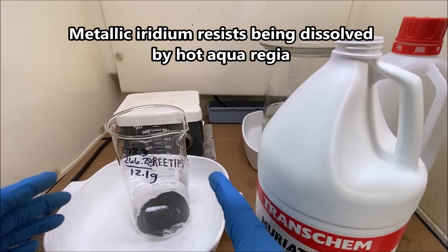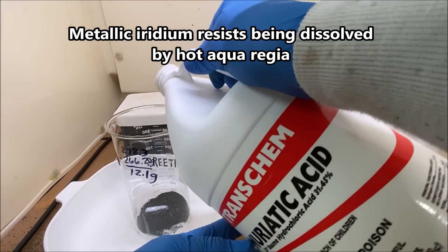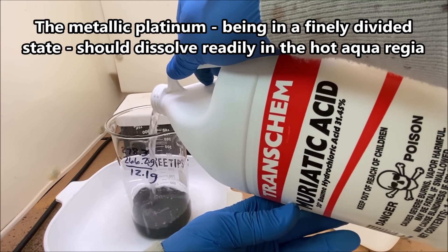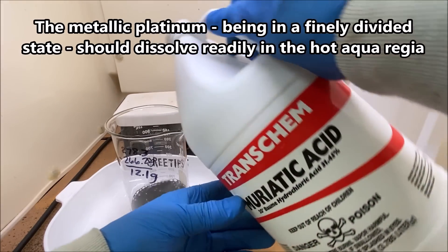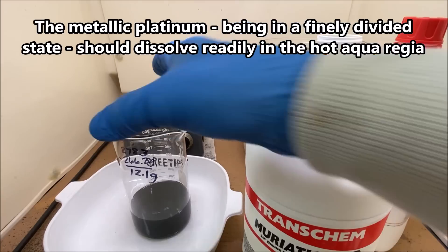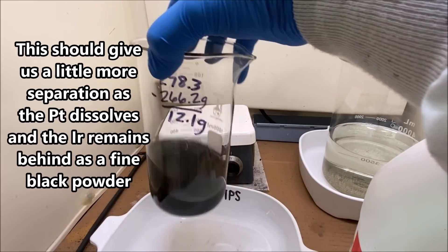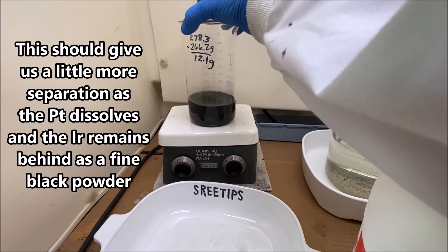Now what we're going to do is dissolve the metal one more time using aqua regia. I'm adding 250 milliliters of hydrochloric acid. Now what we'll do is set this back up on the hot plate stir.